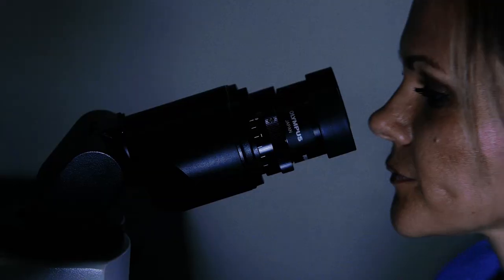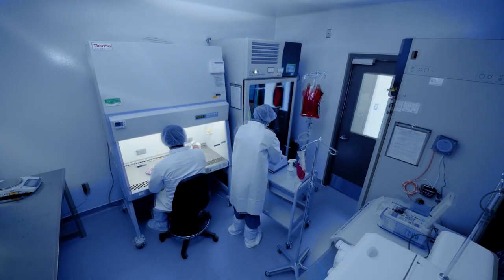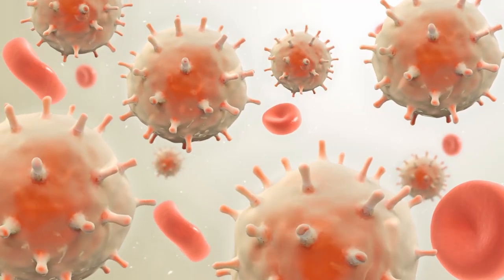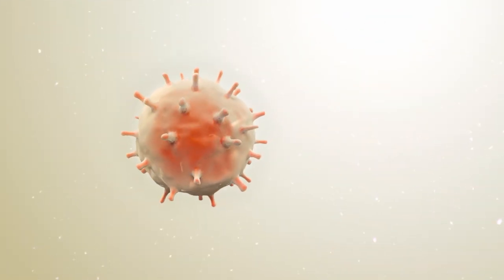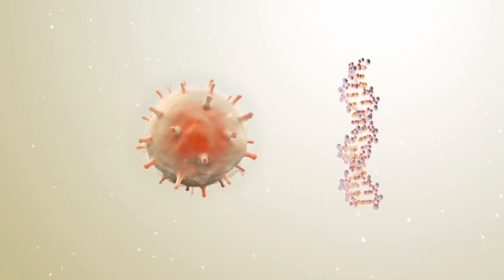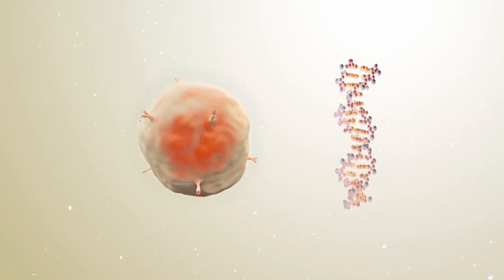At Moffitt Cancer Center, scientists are working to change the natural history of our body's immune system. Through cellular immunotherapy, Moffitt scientists are genetically engineering a patient's T-cells to make them smarter and tougher at seeking out and destroying cancer cells.